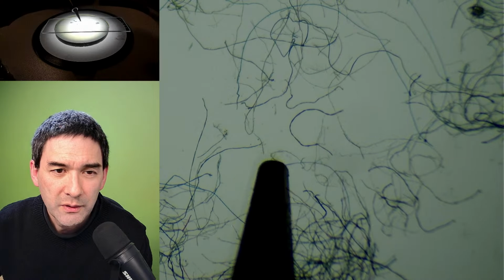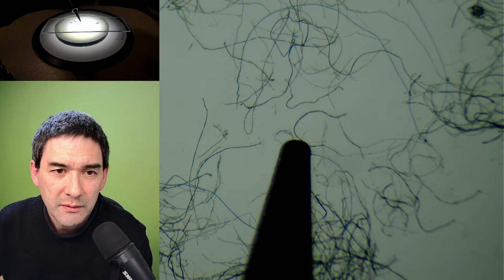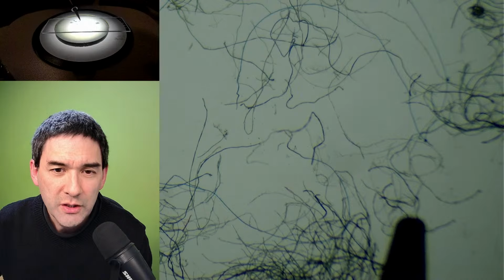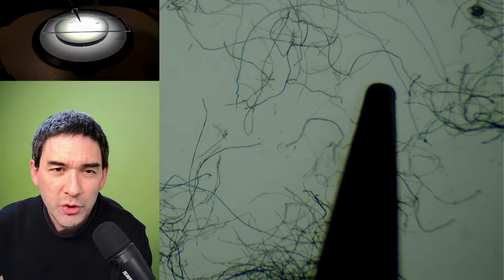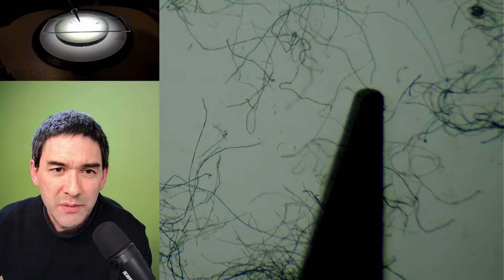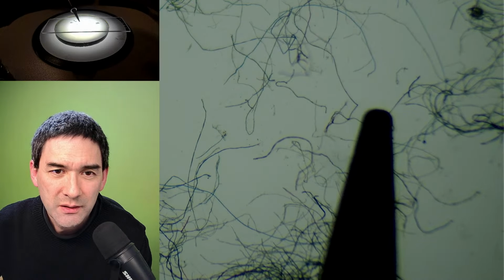I've actually found a few of them just today in the afternoon which did melt and smeared on the microscope slide. So sometimes.